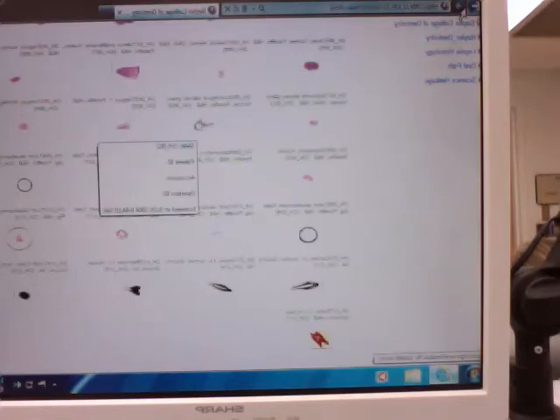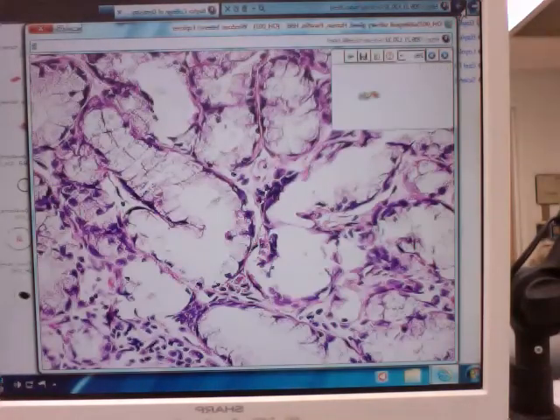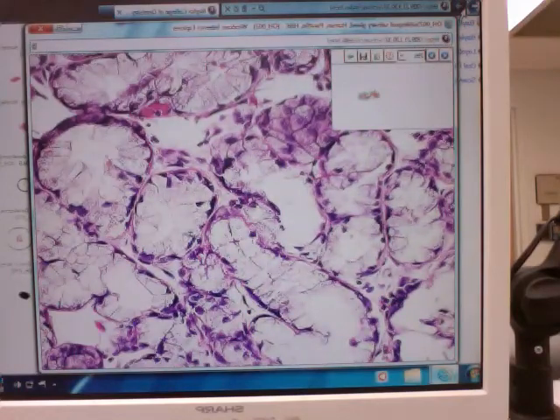Versus if we go down and look at this guy. These are another type of gland. So when you look at this, a couple things I want you to notice. First off, where's the nucleus in each individual little cell? The nucleus is out at the periphery of the cell, out here on the outer, really the basal aspect of the cell. When you look at this, can you see fairly large individual oil droplets like you did before?